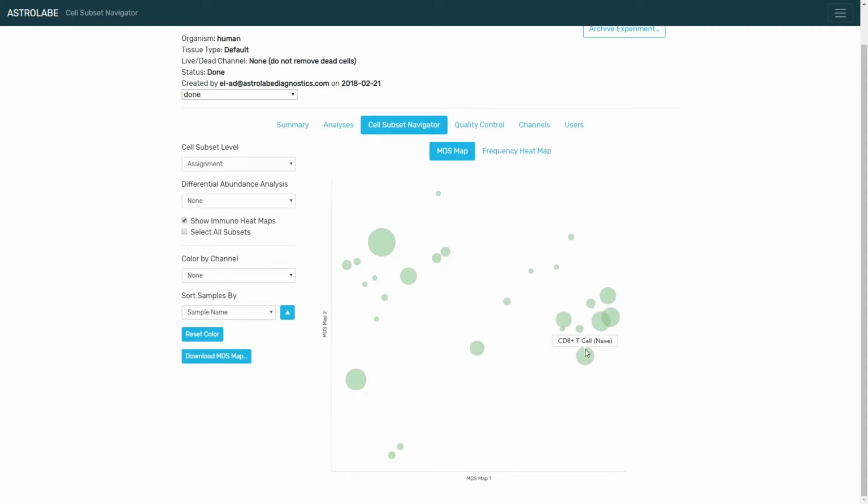So all of the T cells are next to each other, over here to the right, and then the B cells are far away down here, and the myeloids are up there. So in effect, we're maintaining a coherent structure. There is no limitation of a tree, and there are no edges connecting the bubbles because there is no graph underlying this. And yet, the map that we get makes sense and allows us to interact with the data.